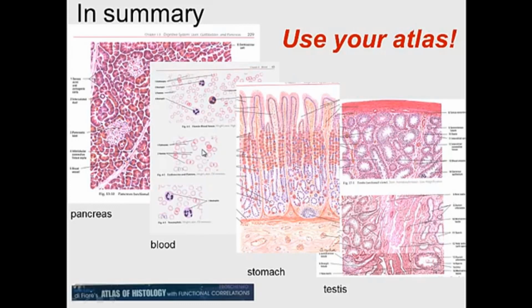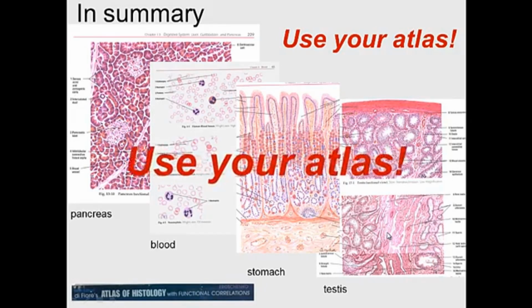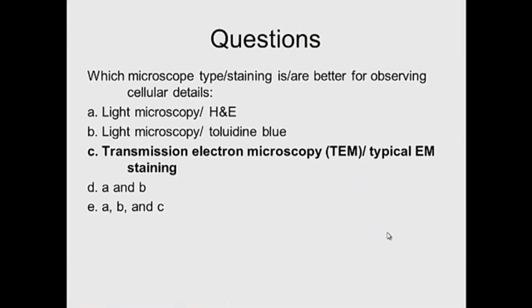And so in summary, remember, use your atlas to be able to identify the different structures that we see because they're labeled already there for you. Using your atlas is very important.